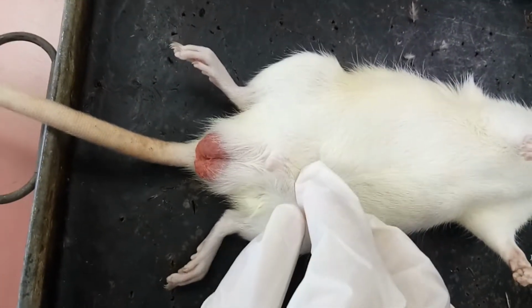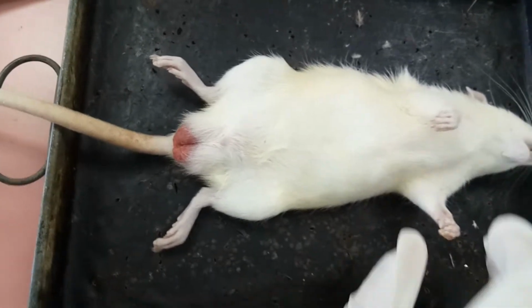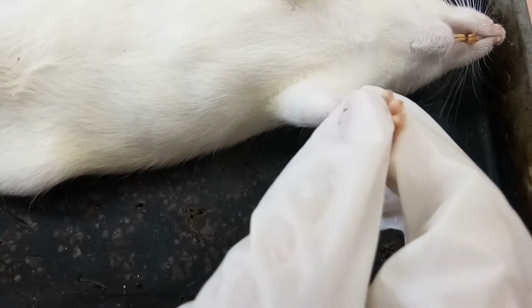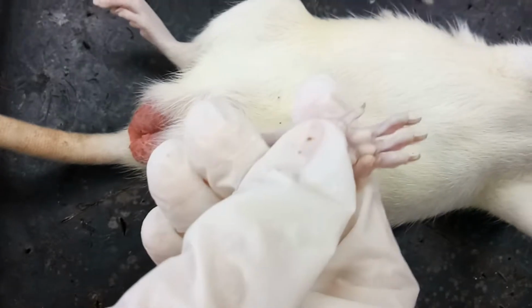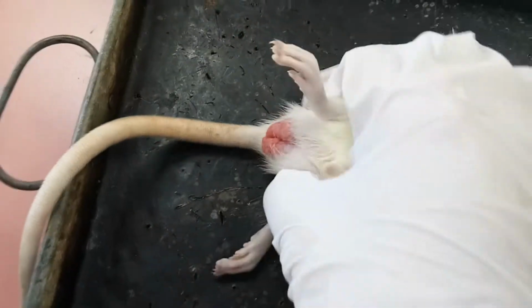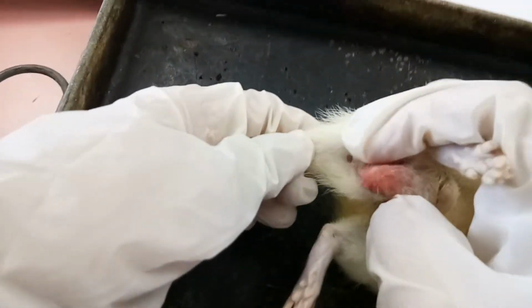Then we can see the forelimb. It has four clawed digits, and you can also observe the 2 hind limbs, which have 5 clawed digits. Below the scrotal sac, we can see the anus, the hole here.